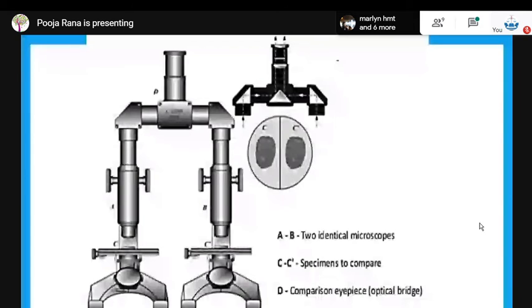The images of the objects are present side by side, which makes it easier for you to analyze. It is quite useful in tool mark analysis, but apart from that, if you are observing pollen grain structure, for example, it would be quite difficult to examine those two samples separately. The main advantage of observing them side by side is that you can put those two samples in a single frame and then compare them. That spares you the tedious task of observing the two objects separately and thereafter comparing those structures. Or else even soil samples.